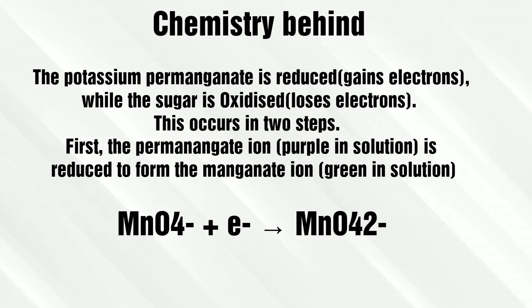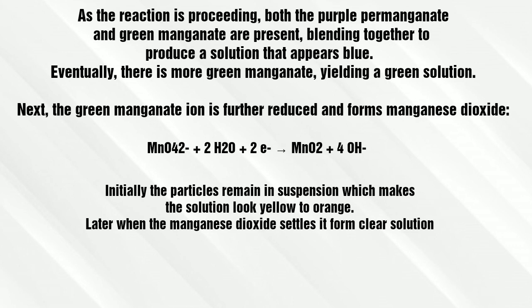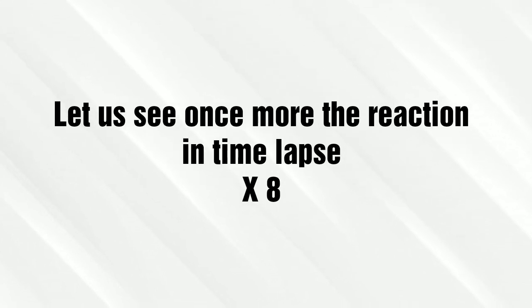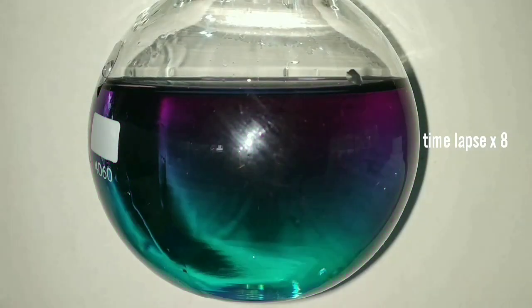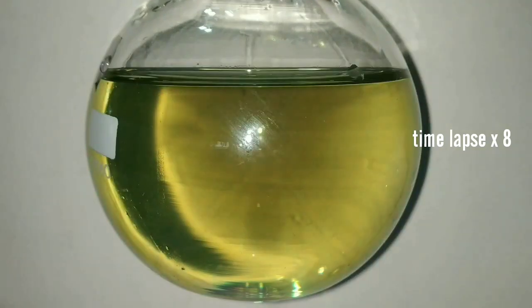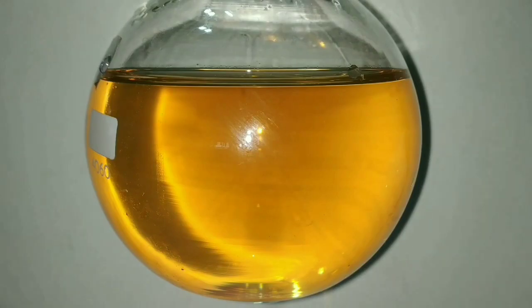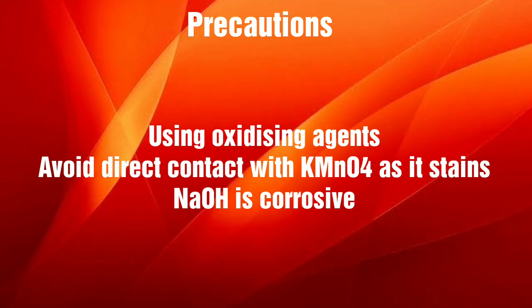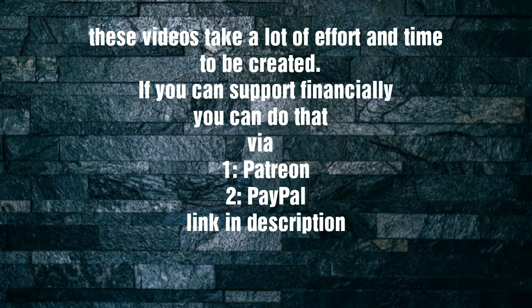The permanganate ion, which was purple, reduced to the manganate ion, which is green. The green and the purple initially made a blue color. On further formation of the manganate ion, it became green in color. The manganate ion then reduced to form manganese dioxide, which gave the yellow-orange color. The manganese dioxide settled down to form the clear solution.